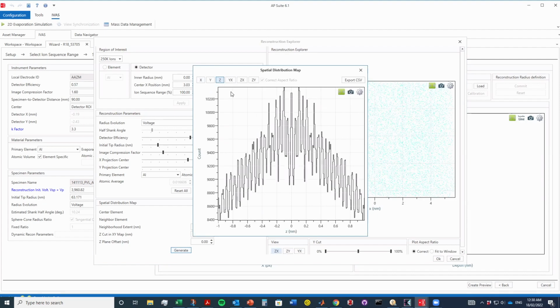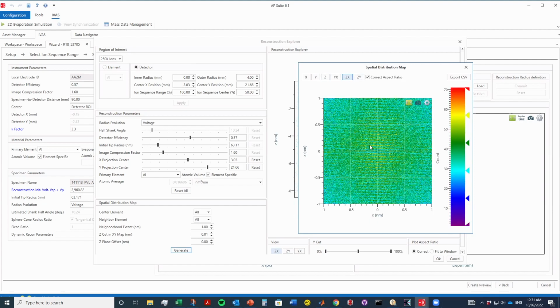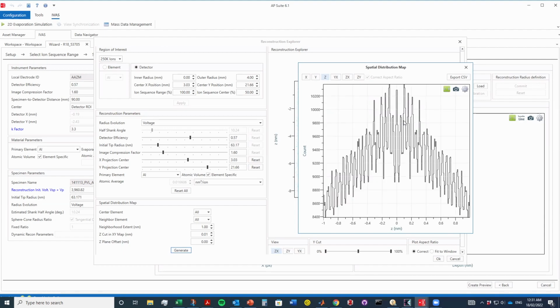Okay. That's what we get. It's pretty clear there. Yeah, you can see that you're picking up some planes there. But it looks a bit different to when I was doing this earlier, but hopefully it'll sort of work out. So that's our central peak. That's first, second, third. I might just go out to the third one here, actually, just because it's getting a little bit noisy.